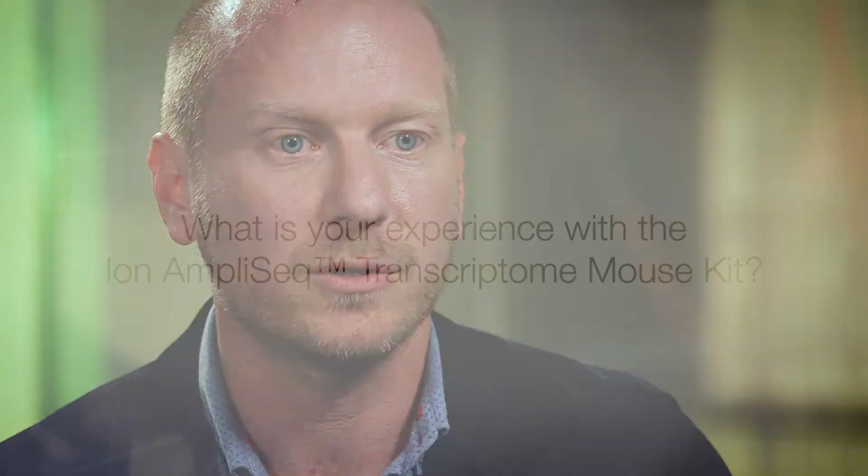So I would say the AmpliSeq RNA workflow has several advantages. So one is that it works for perhaps the samples that are not the highest quality, and also it has a very easy way to get the analyses. So basically we can start a run and then the next day we have a table with gene expression level counts. So it's an easy way to get the bioinformatics analysis sorted.